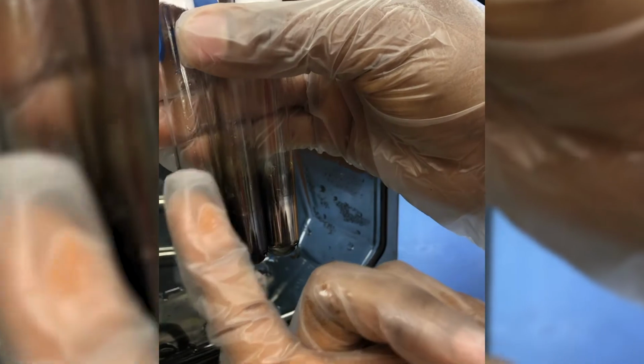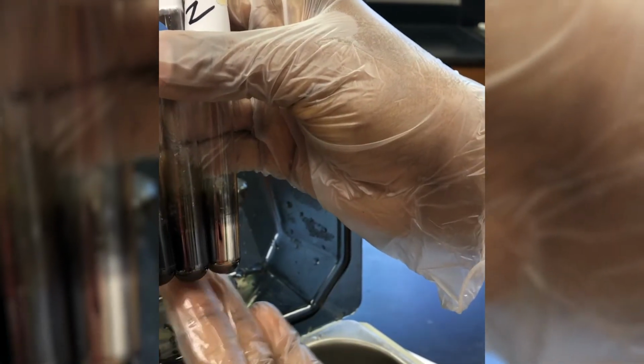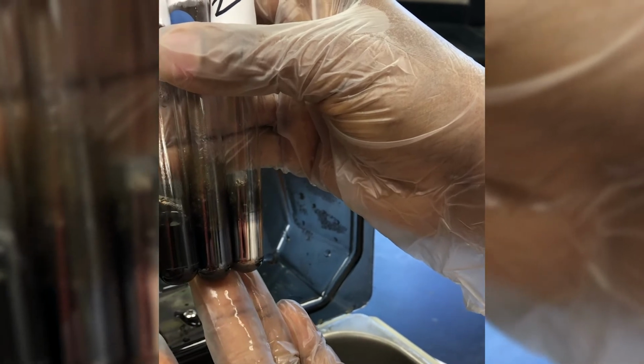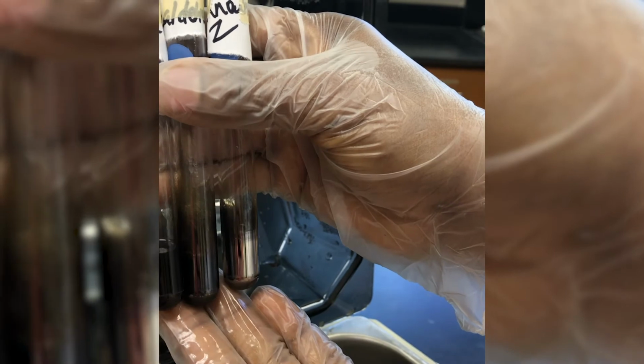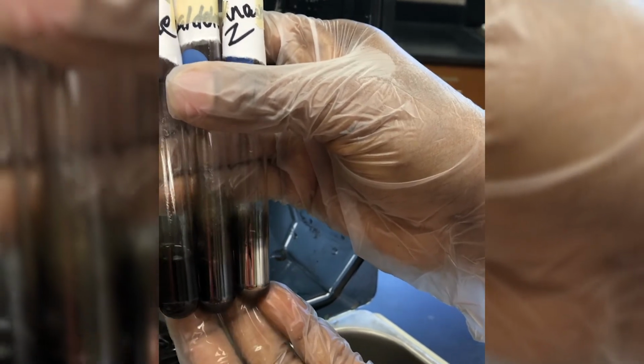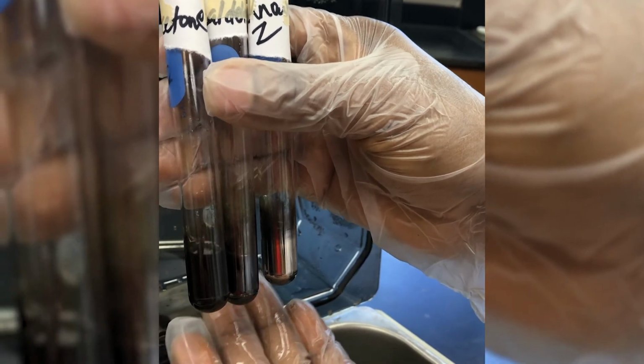So this is acetone with the ketone functional group. This is benzaldehyde with the aldehyde functional group. This is our unknown Z. So you're supposed to use this test to come up with the identification of the functional group of your unknown.